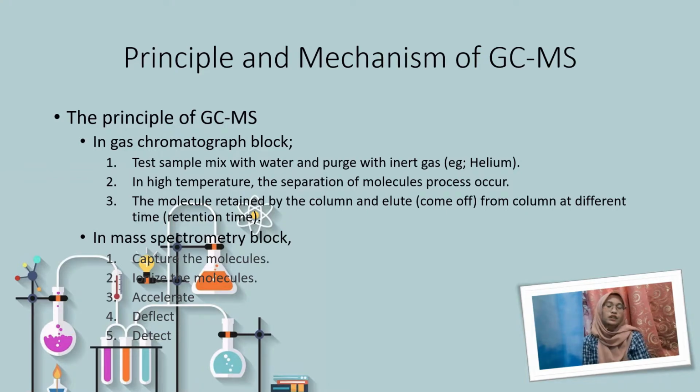After the ionization process, the ionized fragments will be detected by the electron multiplier detector, and the spectra that are detected will be recorded in the computer.